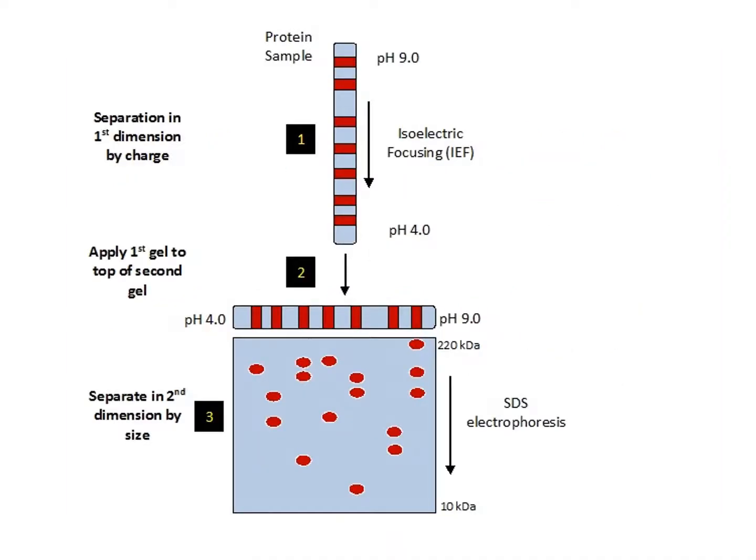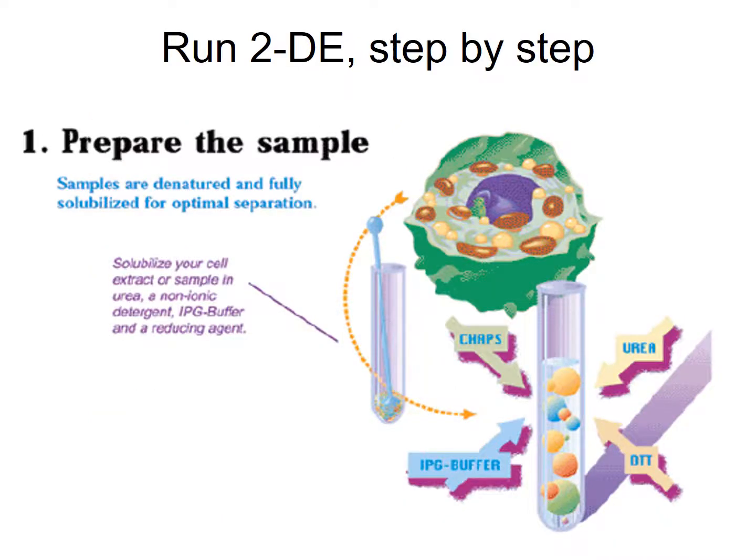And then if it's a little capillary tube, you pop the gel out, and there's some agarose you can put right there, and then put it in a tank and apply electrical current to here, and separated by the second dimension. So first dimension, second dimension. And here are the spots here that you can visualize by staining.